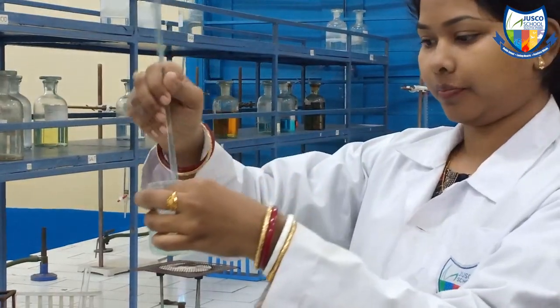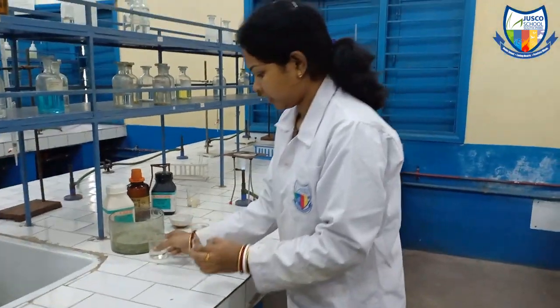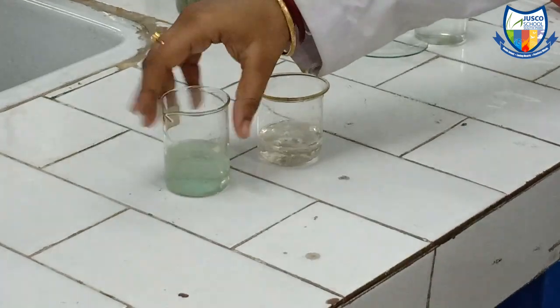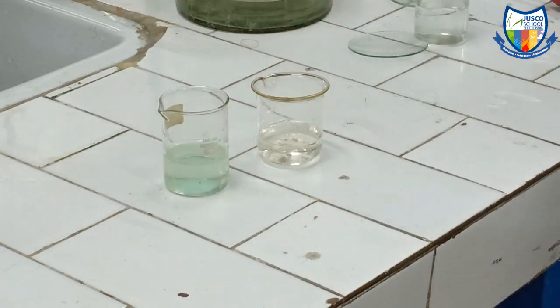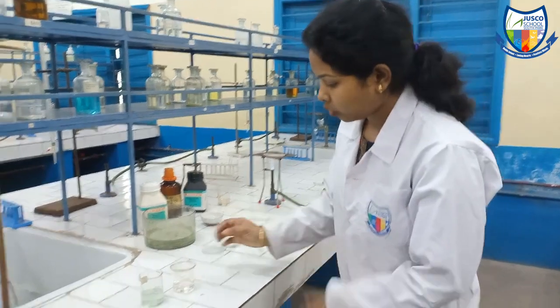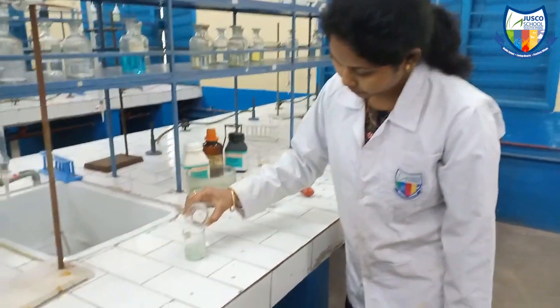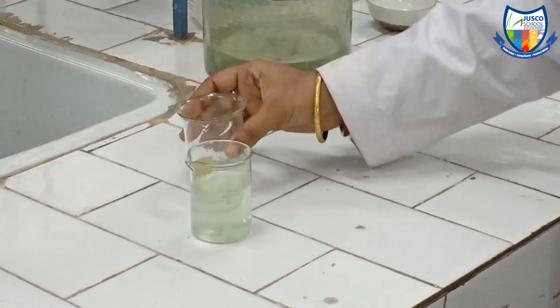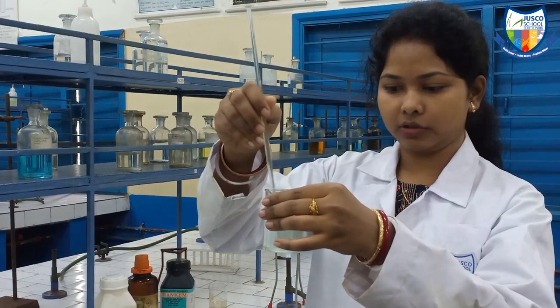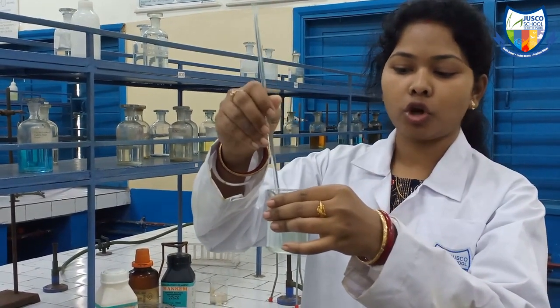Now it is dissolved. We can see two solutions — one is the ammonium sulphate solution and the other is the ferrous sulphate solution. These are equimolar. Mohr's salt is a mixture of equimolar quantities of both ferrous sulphate and ammonium sulphate in water. We will now combine them into one solution, and this is our Mohr's salt solution.